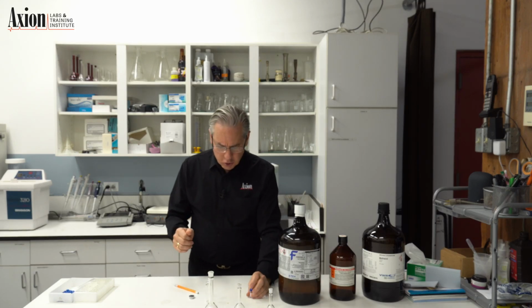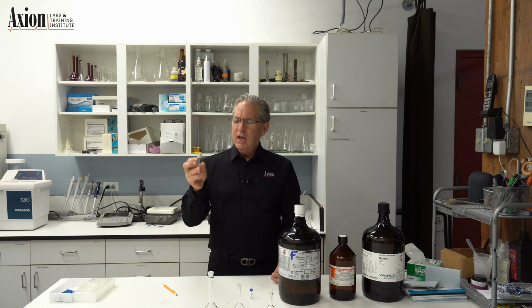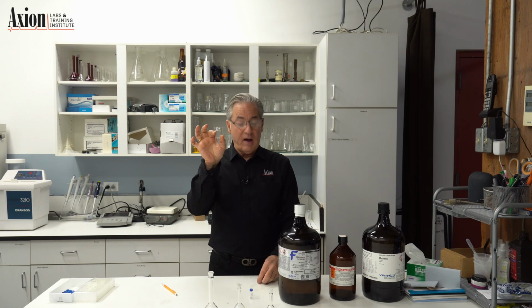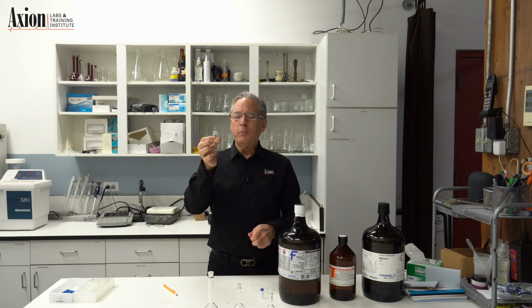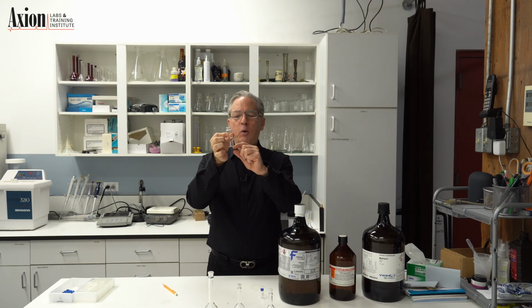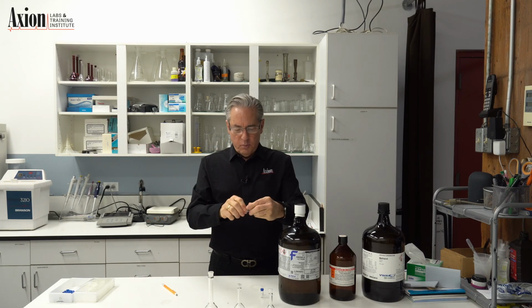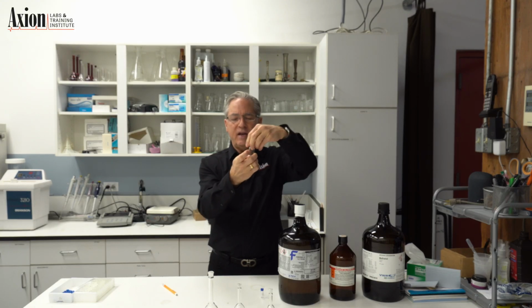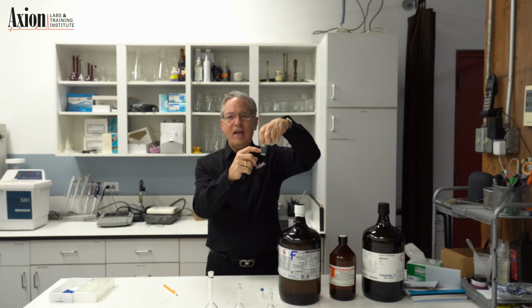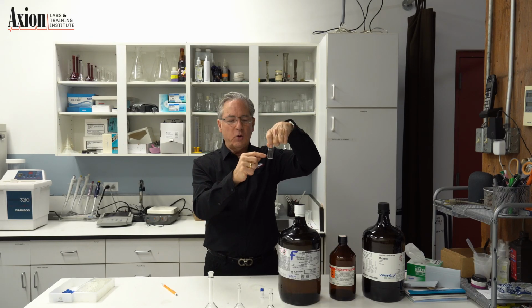Some people will choose what's called Headspace GC. Now, Headspace is fantastic. We're going to use a big vial. This is a 20 mil vial, not a 2 mil, but a 20 mil vial. And the idea is we're going to put a really small amount of sample, maybe 1 or 2 grams or 1 or 2 milliliters. So the sample's down here at the bottom. We're going to put a cap on it, and we'll crimp this guy shut so it's nice and tight. And then the sample itself, we're going to analyze the vapor above the sample. So we're not going to go down and touch the sample. We're going to analyze the vapor above it.